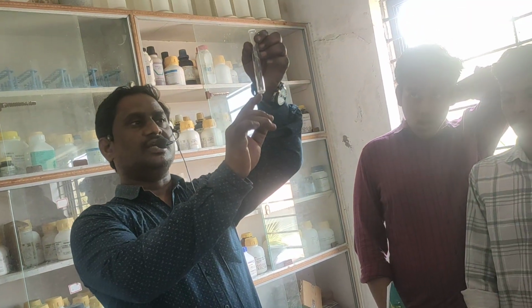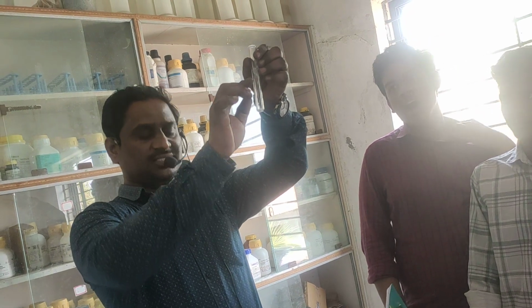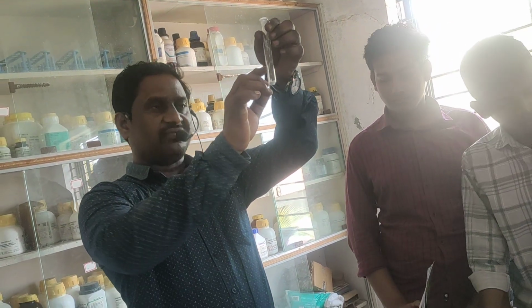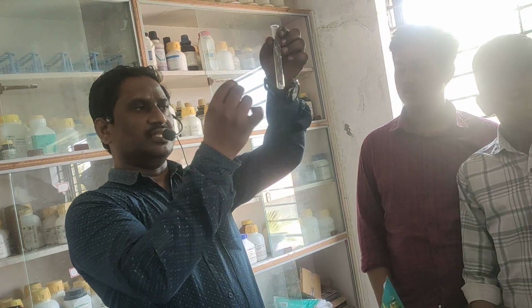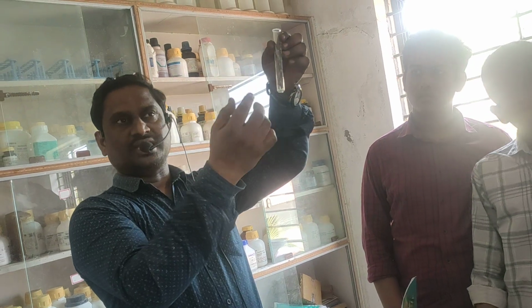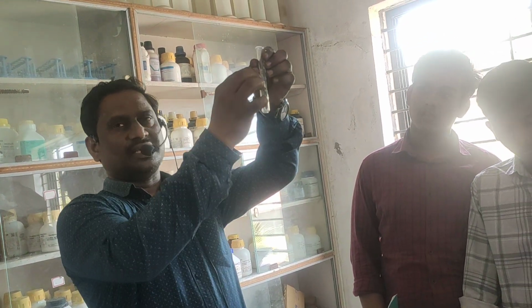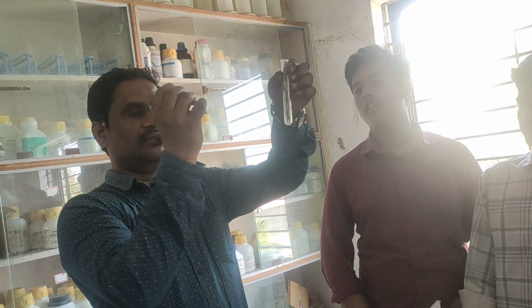For this given salt, if you add dilute HCl, colorless gas is evolved, along with effervescence. Effervescence means foam bubbles. When you observe carefully, it comes fast and goes within seconds. So colorless gas is coming along with that effervescence, like small bubbles.